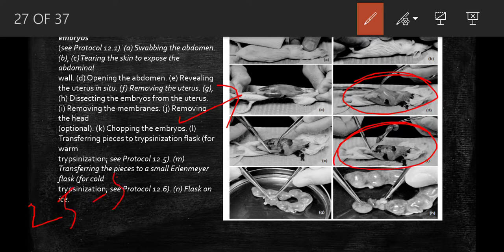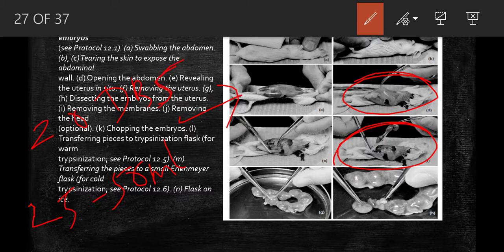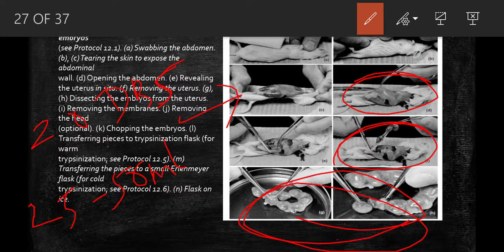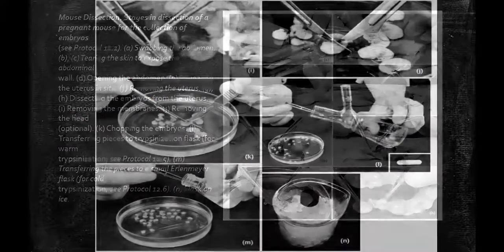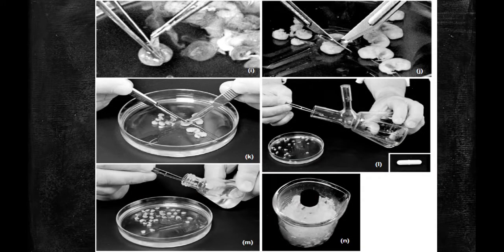The vial contains about 20 ml of DBSS solution. All these steps have to be carried out outside the tissue culture laboratory because the animals can carry contamination. Until you put it in the petri dish, it's carried out outside the tissue culture lab. Then take this intact uterus into the tissue culture laboratory.